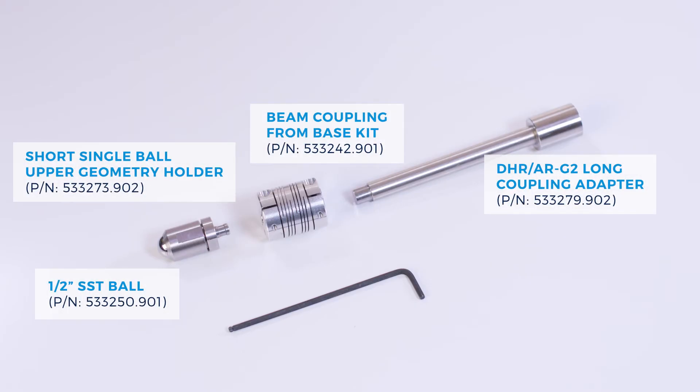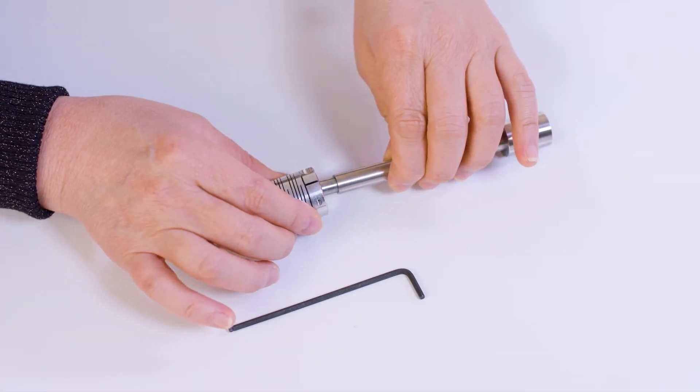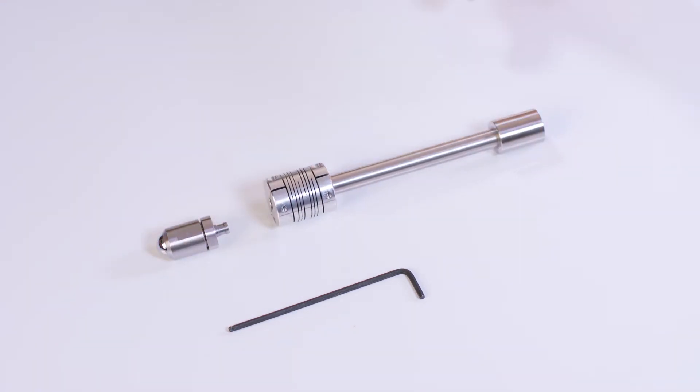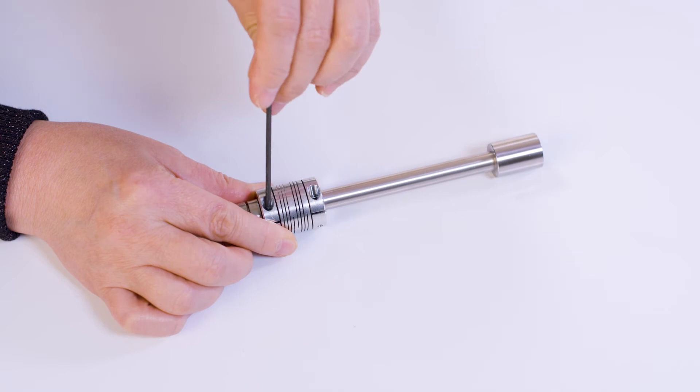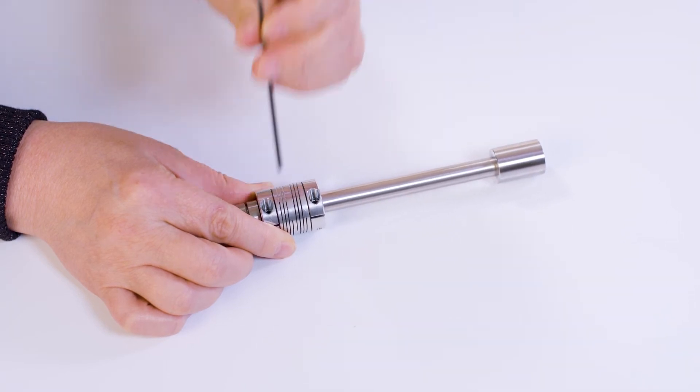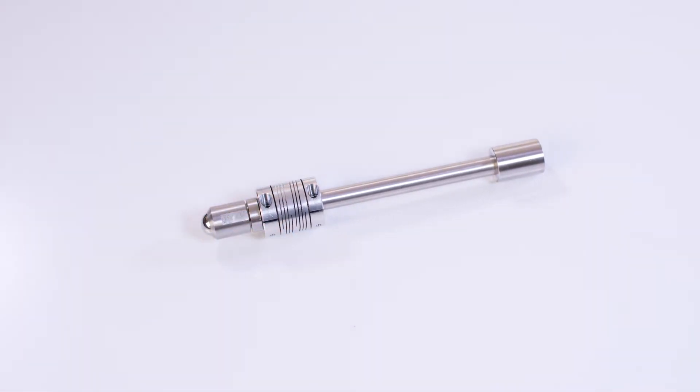For the top fixture, you will need to use this long coupling adapter. Insert the beam coupling, and then attach this short, single-ball upper geometry holder with a half-inch ball in it. Tighten the screws on the side.